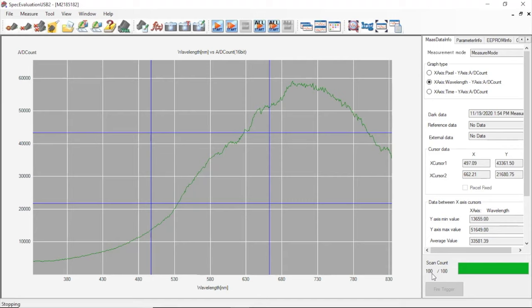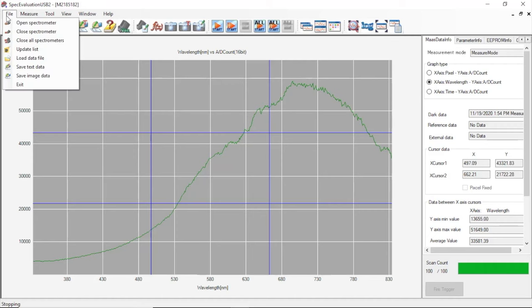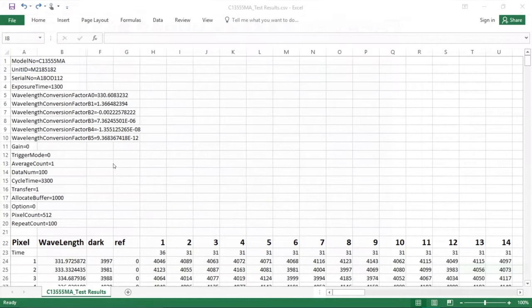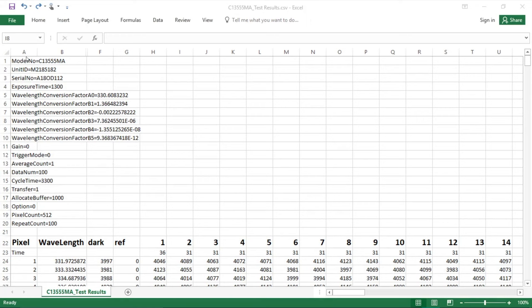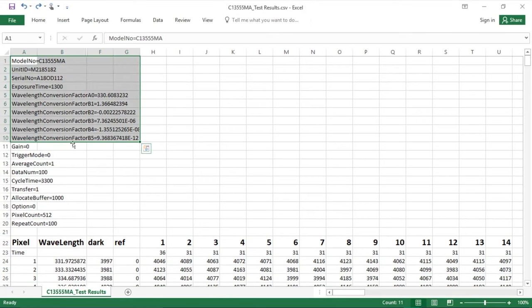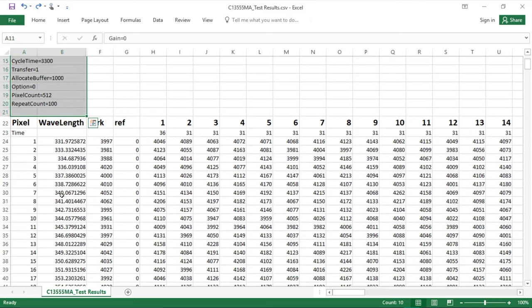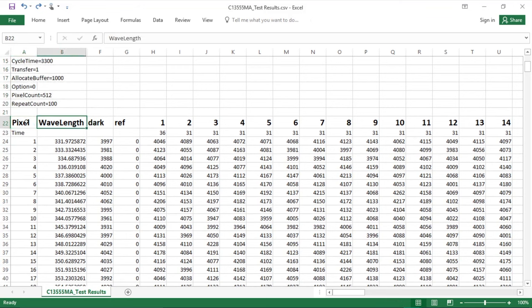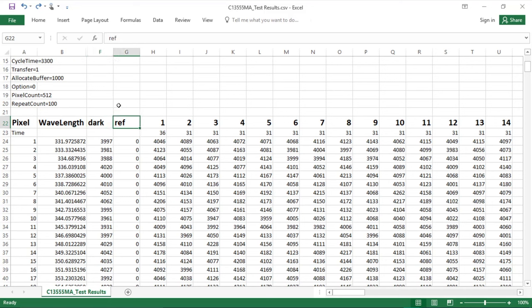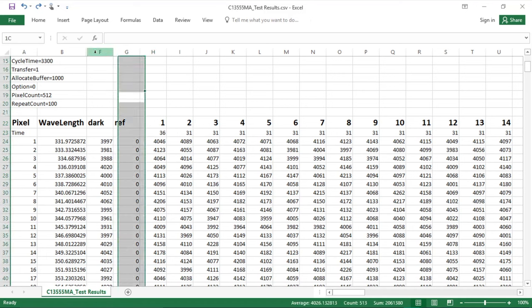We'll start by saving the data we just measured. To do so, go to file and select save text data. Alright, so let's take a look at this data and see what we have. In the top left hand corner we have information on the spectrometer itself. Below that are the parameters for our light measurement. And then below that is the data. This first column represents the pixel number. Next to that is the corresponding wavelength. Next to that is the dark data with each row representing an average of 100 scans. And then next to that is the reference data which we had not taken. Next to that are all 100 light measurement scans.